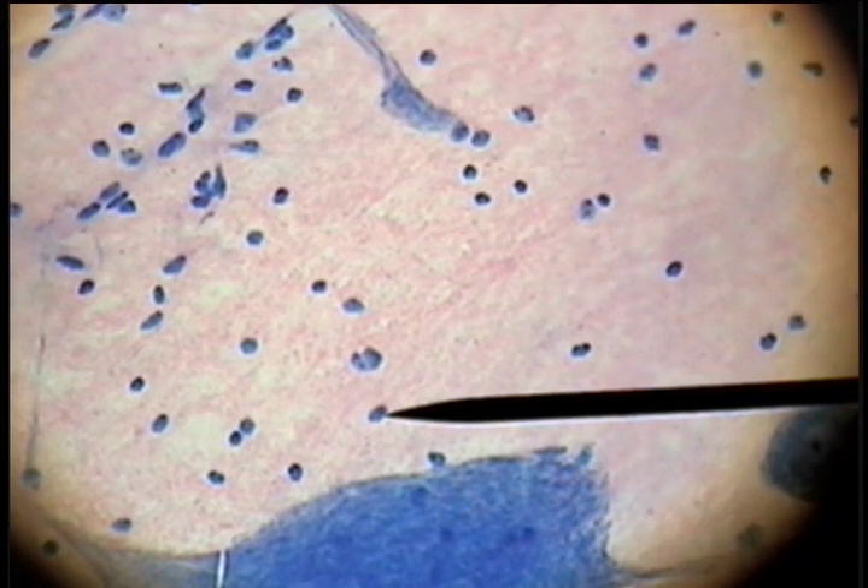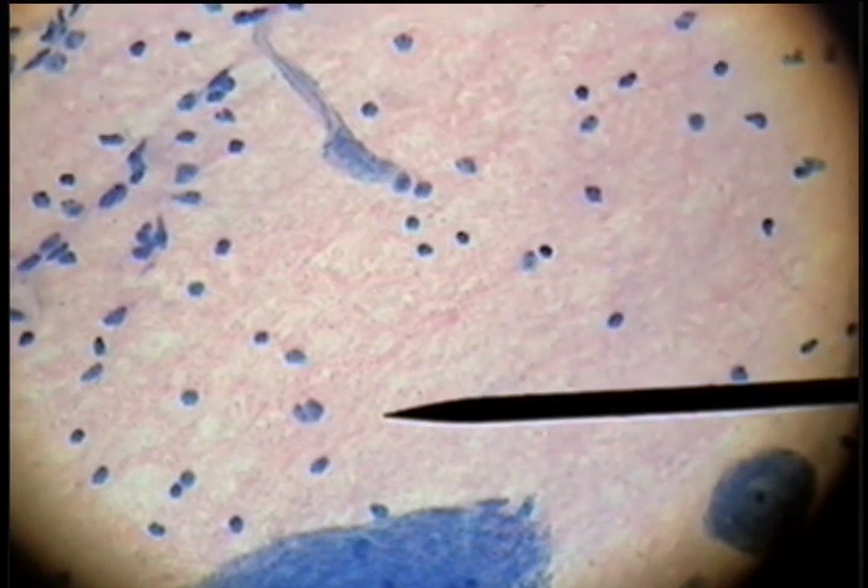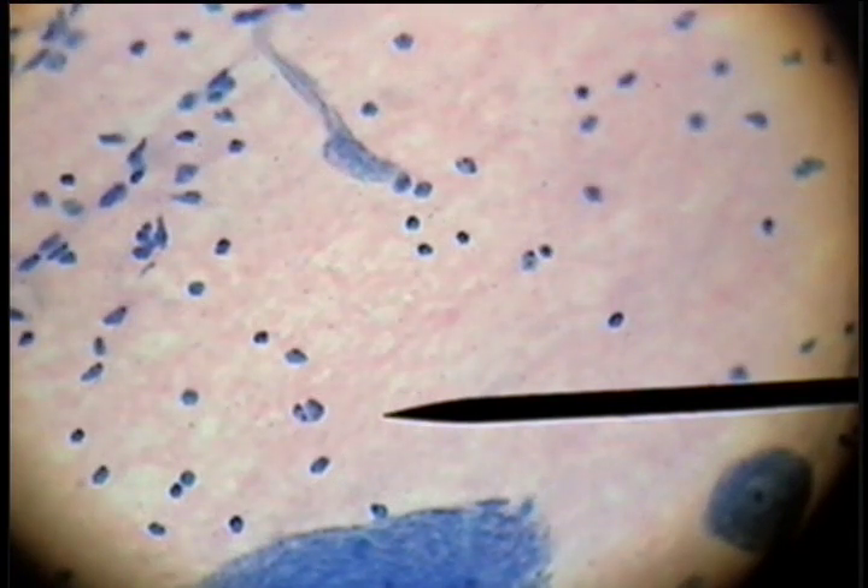The neuroglial cells are the cells that support and surround the giant multi-polar neurons, and this fibrous material here is referred to as the neuropil.